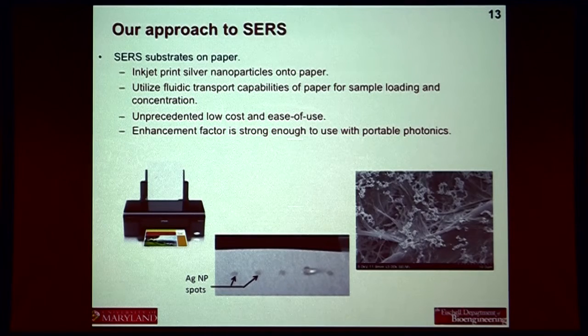What about using something like Teflon or some kind of plastic? Yeah, so we'll get into a little bit more why we like paper so much. But yes, we could use rigid materials as well, as long as we could get the nanoparticles to absorb and stick somehow. In this case, the nanoparticles get embedded into the fibers pretty well and become immobilized that way. We actually found that if we use very tight pore paper, the nanoparticles don't stick very well. So there's a nice pore size to get the nanoparticles in, but then they don't move anymore after that.